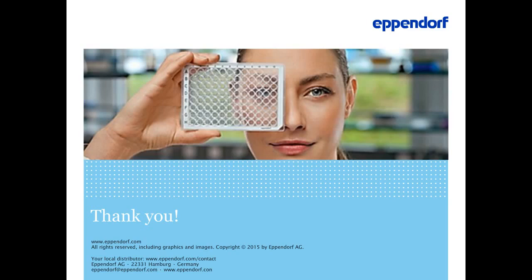Why do you recommend clear plastics? Well, it's simply because colored consumables, colored plastics, have some additional additives regarding exactly the color. There are the detergents, the substances dispersing the dyes, and most of the dyes can also be found later on as a leachable in the sample. So whenever possible, for sensitive analytical methods, I would try to work just with clear consumables.